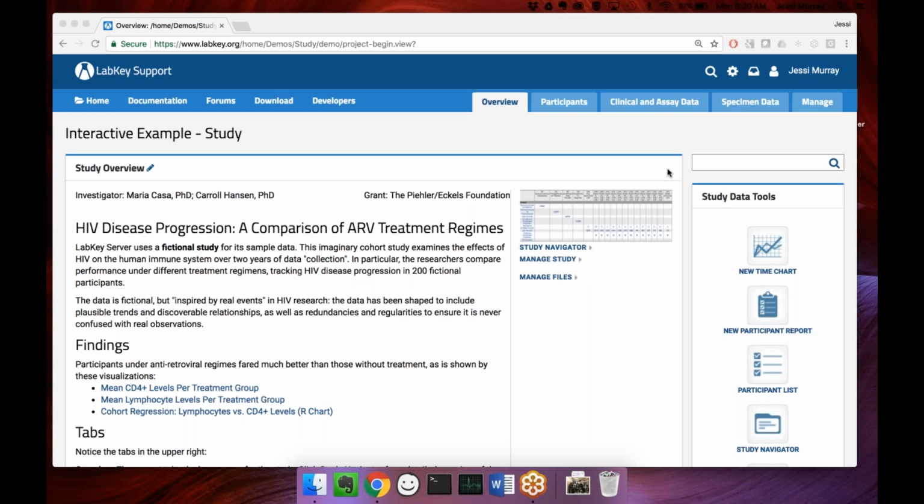Awesome. Thanks so much, Jessi. It's really great to see all of the cool changes that have come with this new release. If anyone has a question at this point, go ahead and submit that in the question panel. We did get one comment through that one of our users loves the row highlighting. Thinks it's very useful, so way to go, Jessi, on that front. Awesome.